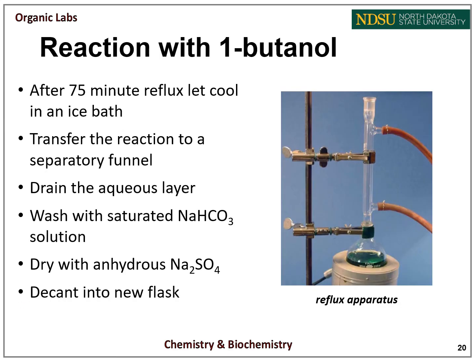Now finishing up the reaction that is under reflux, the 1-butanol reaction. After the 75-minute reflux is done, we will let it cool in an ice bath. We'll then transfer that reaction to a different separatory funnel. We'll drain the aqueous layer, wash the organic layer with saturated sodium bicarbonate solution, separate those layers, and then dry the organic layer with anhydrous sodium sulfate, and then we'll decant the liquid from the leftover sodium sulfate into a new flask.